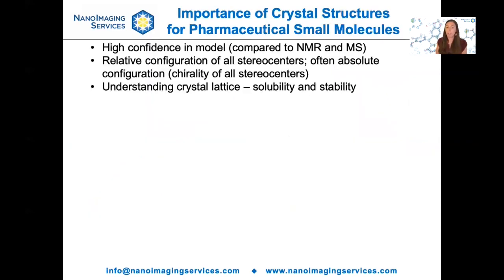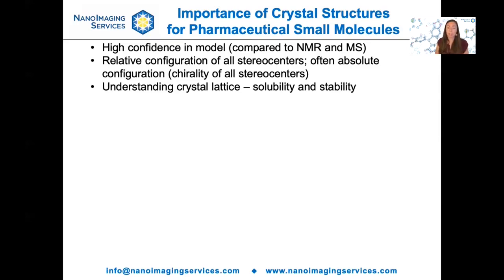Crystal structure determination for small molecules in the pharmaceutical industry is incredibly important, and this has been increasingly recognized by the FDA, which typically requires that anything submitted for an IND filing have a crystal structure associated with it. Crystal structures give you much higher confidence in your model compared to structures from NMR, mass spectrometry, or any other technique. Additionally, you can determine the relative configuration of all stereocenters using crystallography, and the absolute configuration is often possible when using x-rays. You can also understand information about the lattice building up the crystal, which has important implications for solubility and stability.